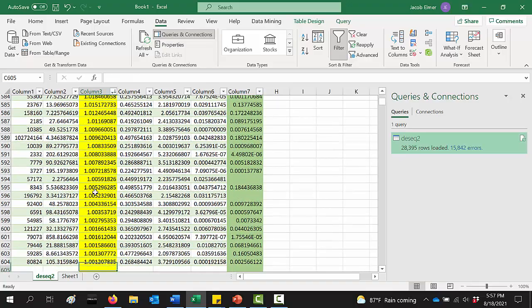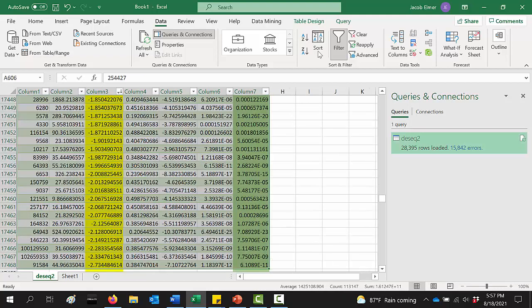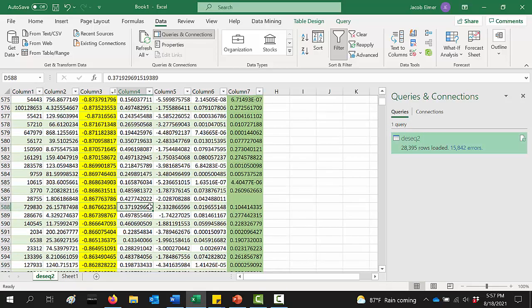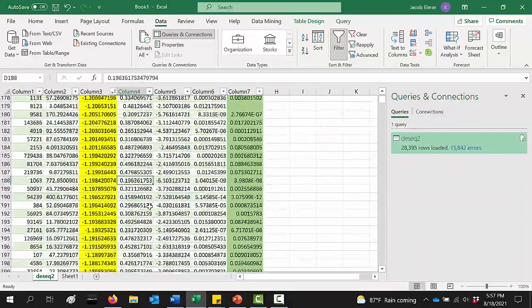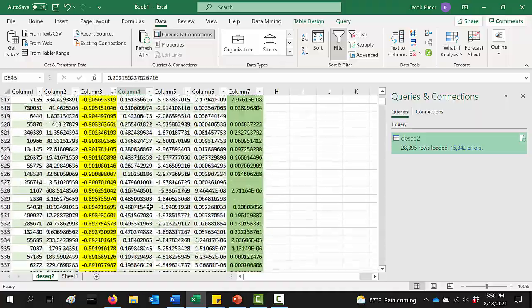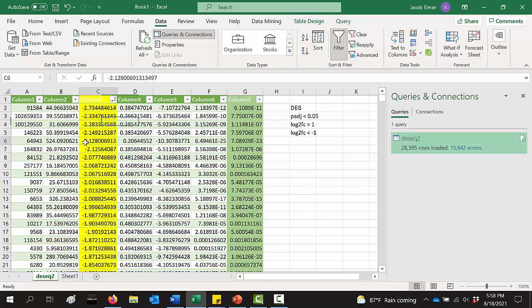Now I can do the same kind of analysis. Let's see, let's go down here. For downregulated genes, I could highlight these data, Control-Shift down, do a data sort on them as well, but this time go from smallest to largest. Again, based on column 3, that's my log 2-fold change. There we go. And whoops, what happened here? Oh, I'm just down at the bottom. Okay. Oh, what did happen here? Did it change that entire column? Ugh. Well, anyways, this still shows what we're trying to get at.